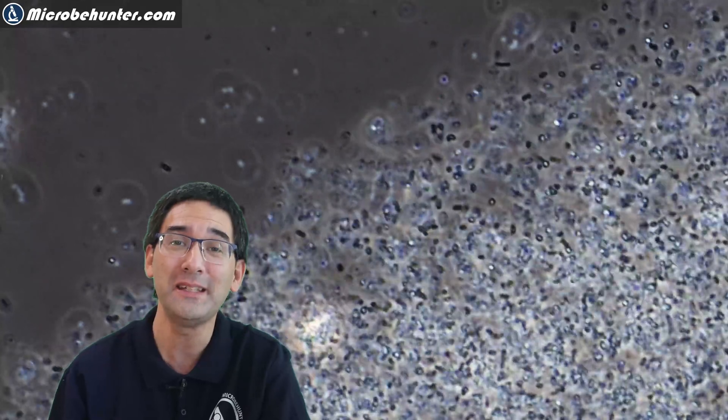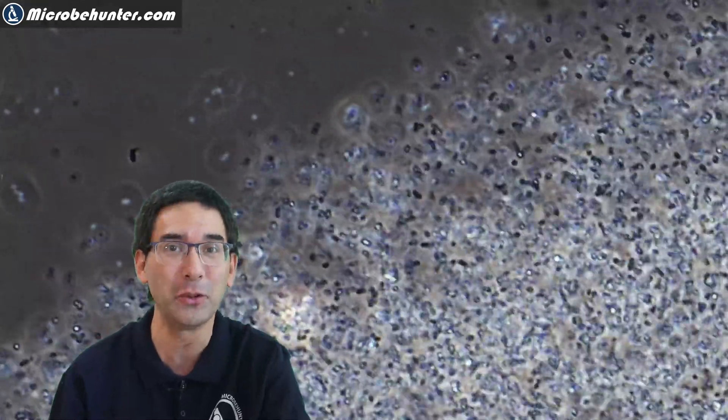MicrobeHunter here. I do receive a lot of questions and sometimes also comments from my viewers who want to know how can you grow bacteria, like you see here in the background, at home so that you can look at them under the microscope? And usually I'm not quite happy when I receive questions like this because growing bacteria at home is generally something that you probably should not be doing, especially if you don't know which bacteria you're growing.